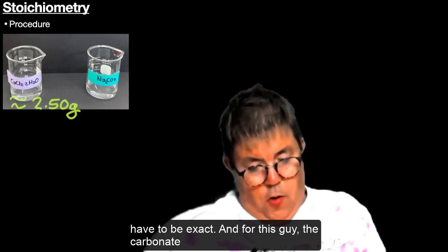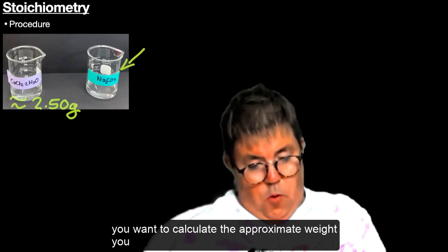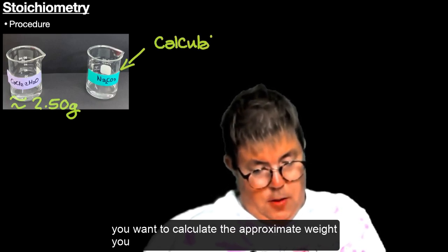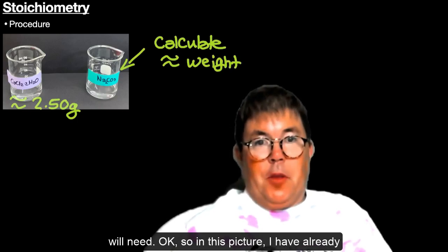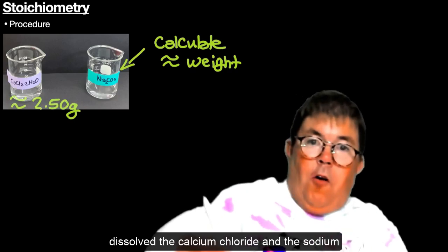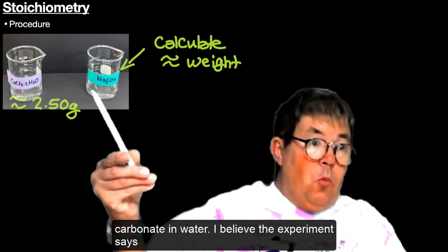And for the carbonate, you want to calculate the approximate weight you will need. In this picture, I have already dissolved the calcium chloride and the sodium carbonate in water.